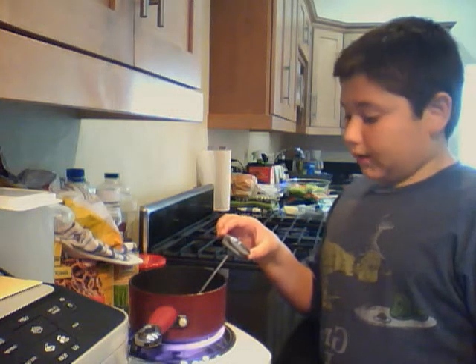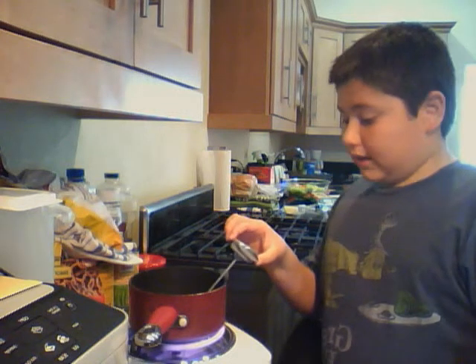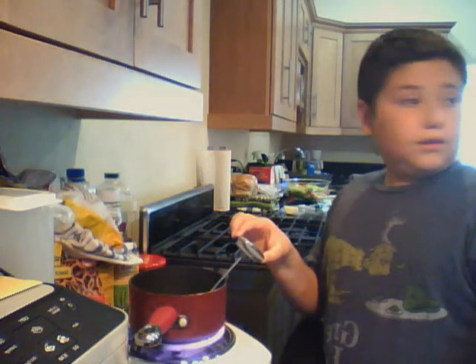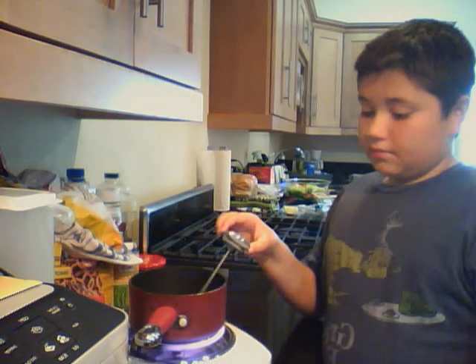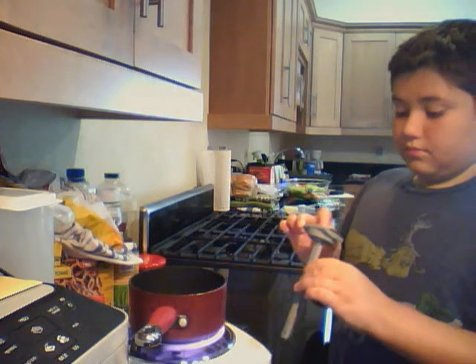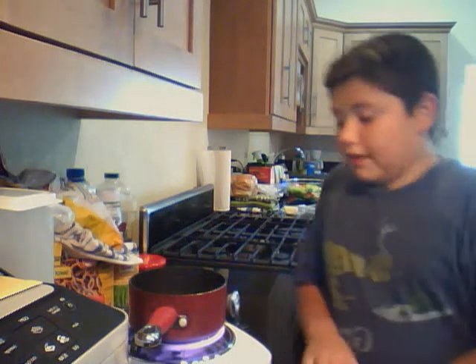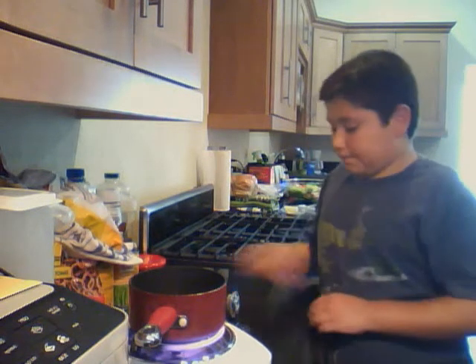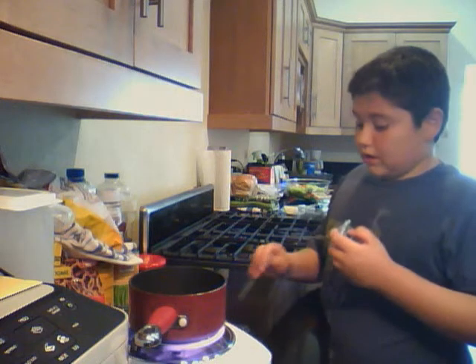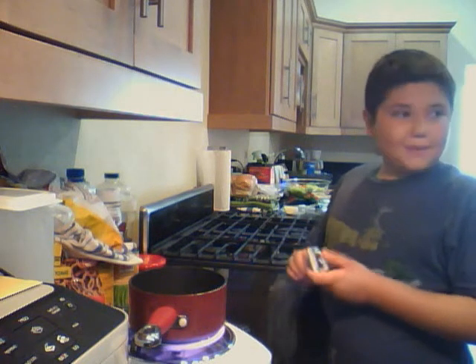It stopped at 208 degrees, now 211. It's still going. It is really getting hot and you can see there's a lot of steam coming out. Let's see what the hot plate is — it might burn.